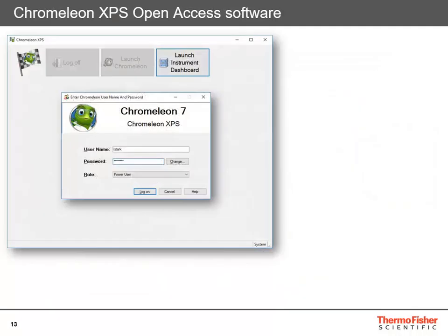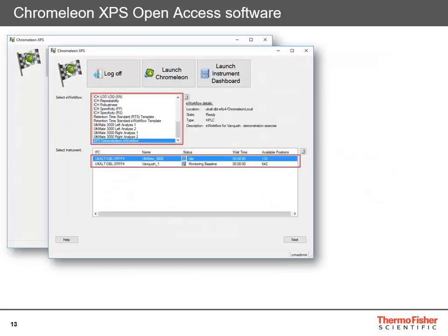When you open Chromelion Express, it's a separate application. You log in with your normal Chromelion user ID and your roles are specified. It then presents you with a list of e-workflows available based on your login. When you select the e-workflow for the analysis you want to run, it displays in the bottom box the instruments available for that analysis, giving you the instrument status — whether it's running, monitoring, or idle — the wait time before it's available, and the number of injection positions available in the autosampler.